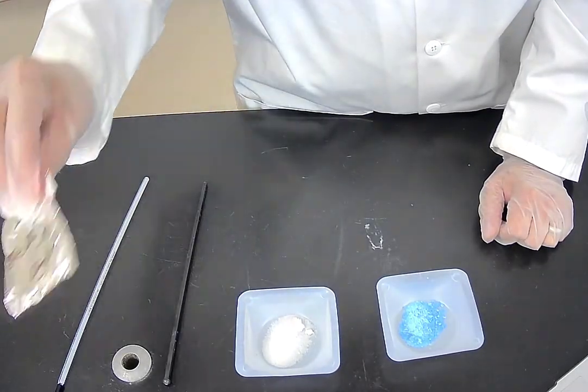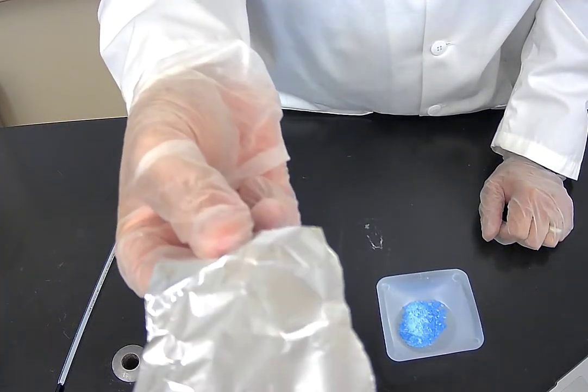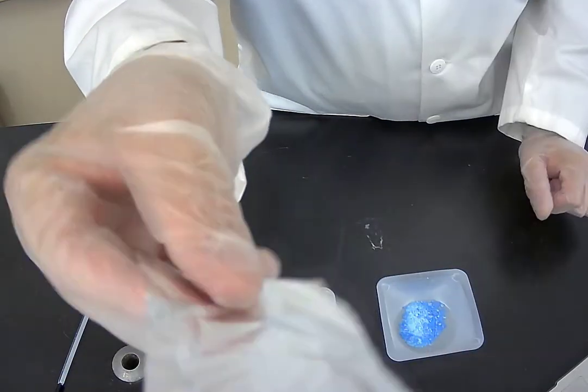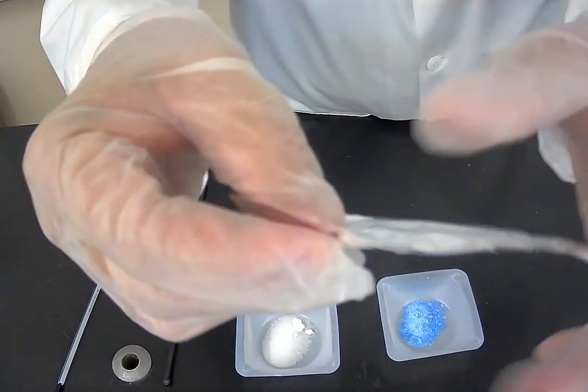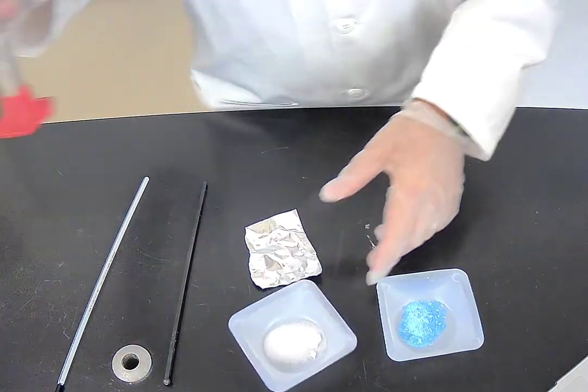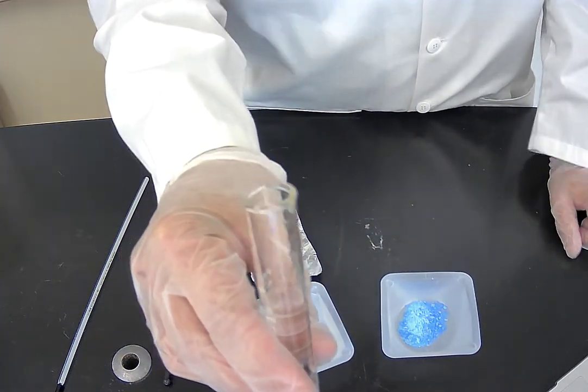We have some aluminum foil, right, highly malleable. It can be pounded into sheets. It's silver in appearance. It's a solid. I can tear it as well. And we also have some 25 milliliters of water here.